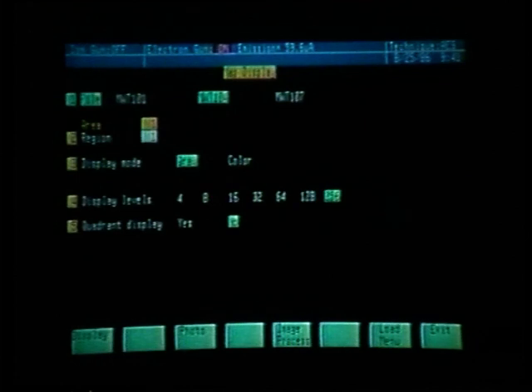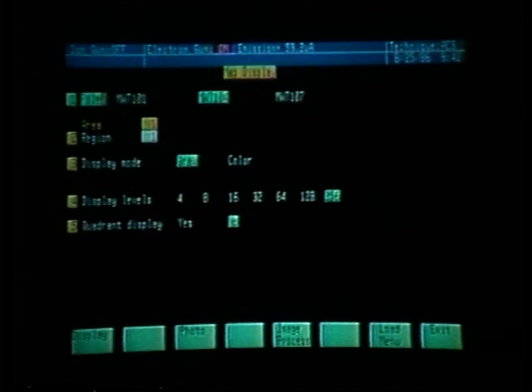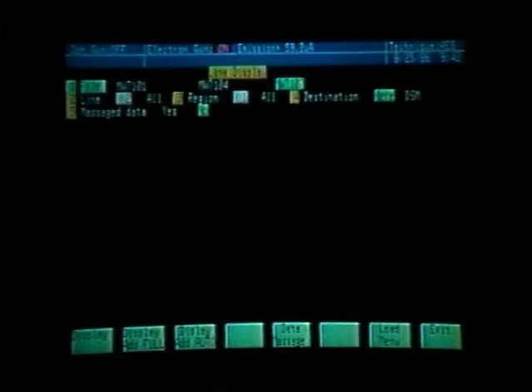We now want to superimpose the gold line scans, file MWT107. We can toggle to MWT107, strike enter. Line number 2 is across the gold, and so is line number 3.